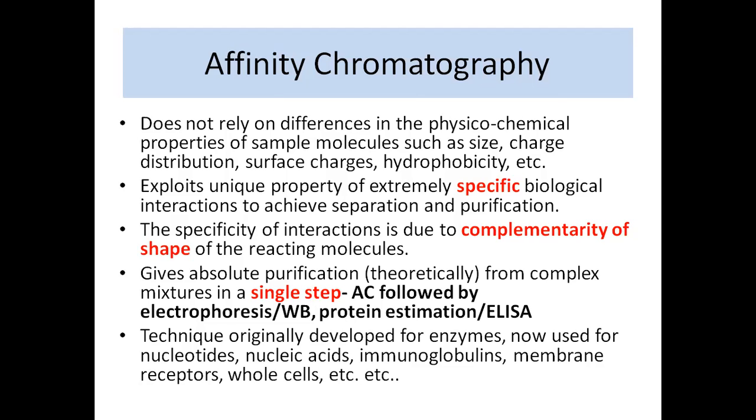But nowadays, this technique is so versatile and so useful that almost anything in the world can be separated using affinity chromatography, because we know that antibodies can be made for anything. And therefore, if you have the antibodies bound to the stationary phase, then the complementary molecules can be separated by affinity chromatography.